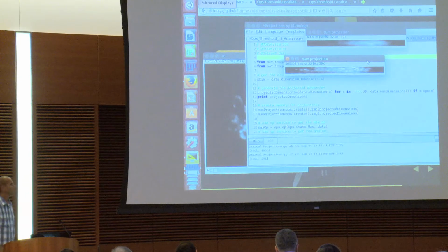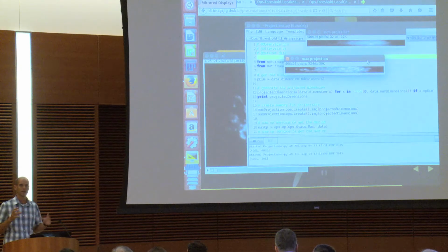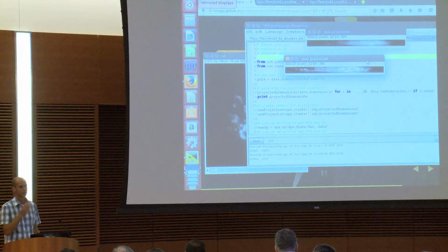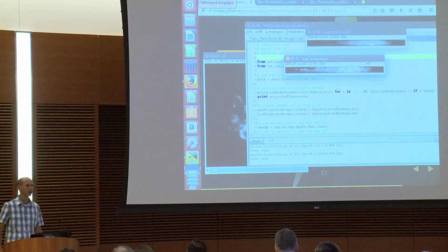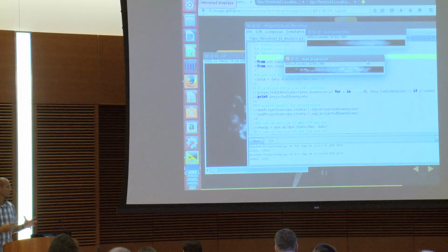Especially for stuff like deconvolution, this is really important because, as I mentioned in that presentation, everything often works really great in x and y, and if you just look at your x and y, you think everything's okay, and then as soon as you look at your third dimension, you realize that there might be artifacts, or you might not have the really good reconstruction along that axis.